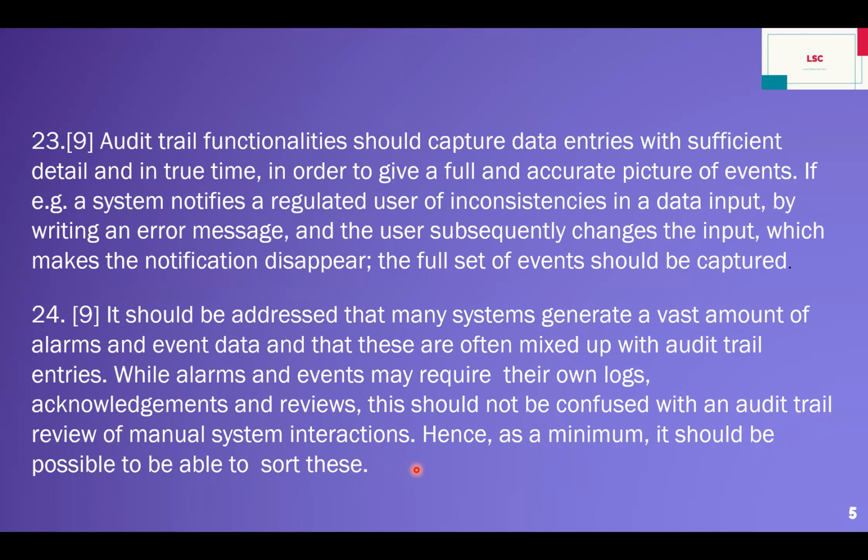So in this type of system, either there is a sorting feature so that we separate these things from the audit trail, or there should be a different path to capture events and alarms, and a different path for your audit trail. This is a very good point given by the concept paper. In our day to day life we face these types of problems.